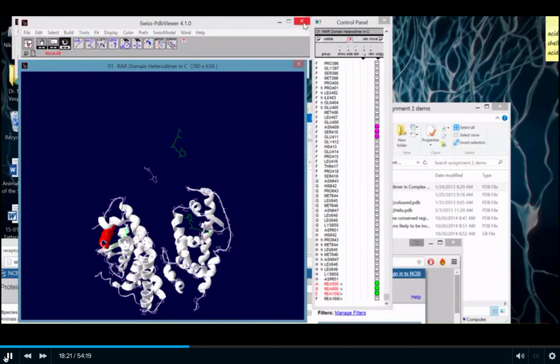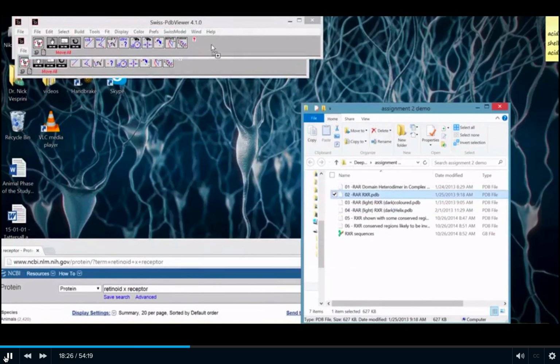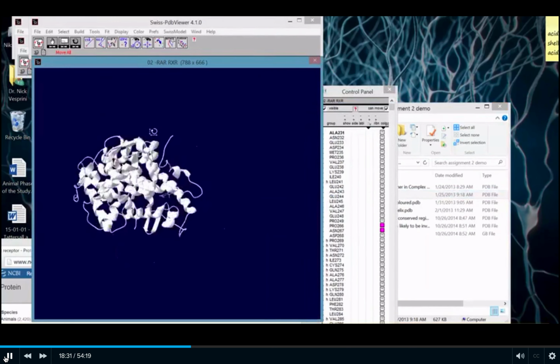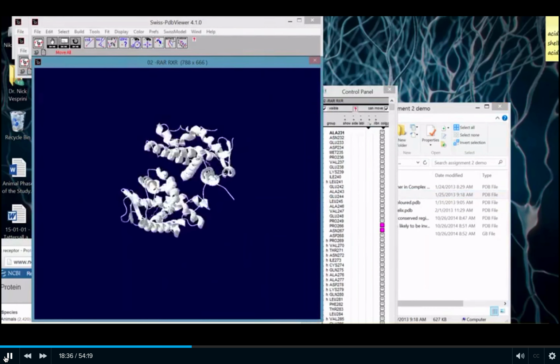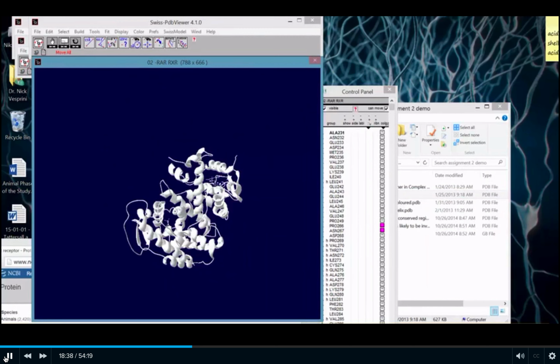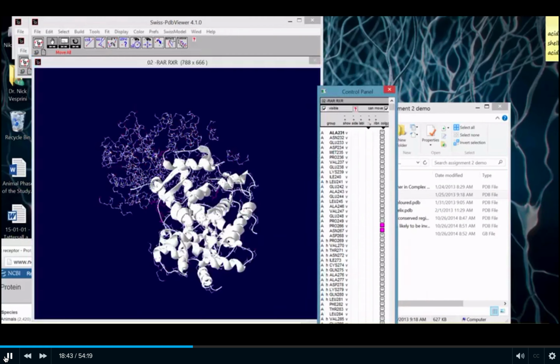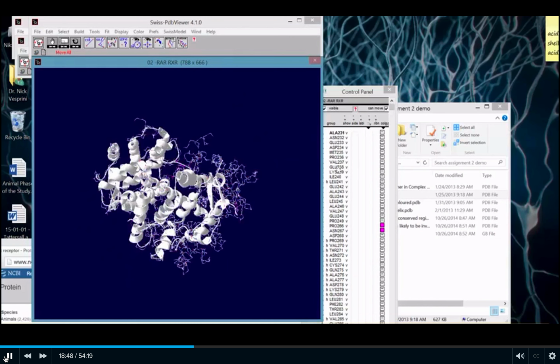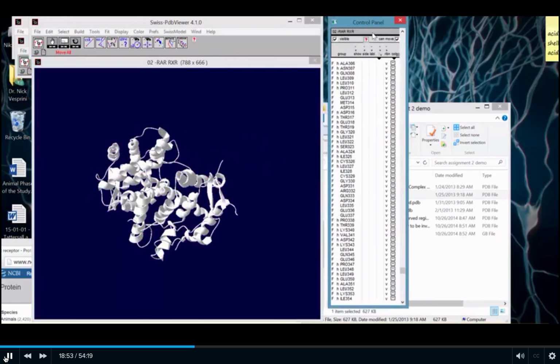So that's a quick crash course so far through just this protein. Now, with regards to my original purpose, find the RXR and RAR and explain why they're hetero or why they're promiscuous versus stringent binding, I'm going to have to do some research, see where the ligands are, and I can kind of see that here, and then I could zoom in and actually start to work on this, either with primary research or other tools or techniques. But if I wanted to see where the ligands are, with regards to where they're binding, the best bet would be to go to the primary research and actually read about it.